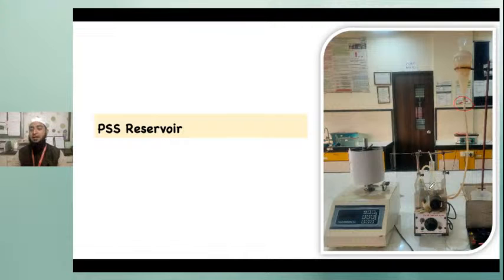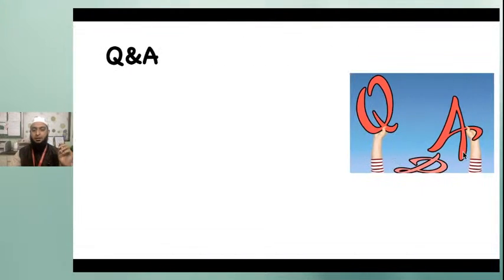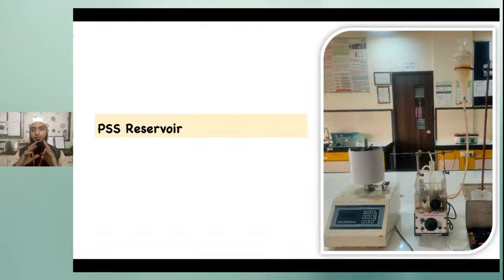Whenever you discard that, you need to refill by using this stopper. You can just open this stopper so that the physiological salt solution can move from the reservoir into the internal organ bath. So this is the role of the physiological salt solution. You are using it just to store the PSS, and as and when it is needed, you can move that PSS into the internal organ bath. So this is the basic setup which is needed to perform the experiment on the contraction of the muscle.